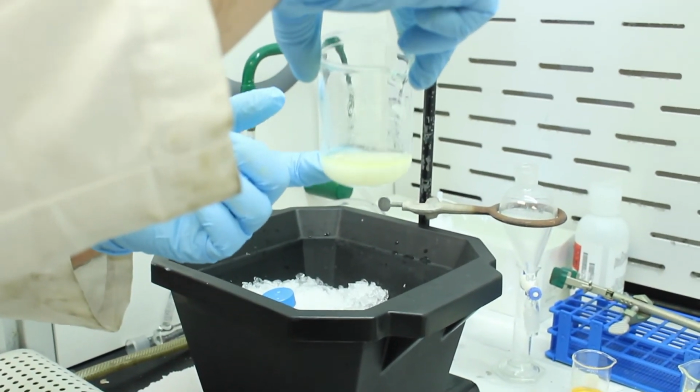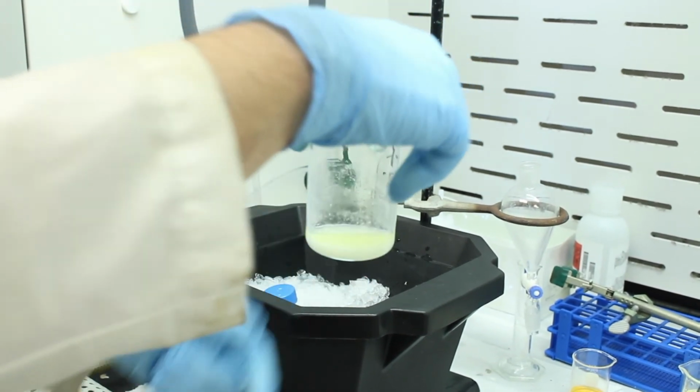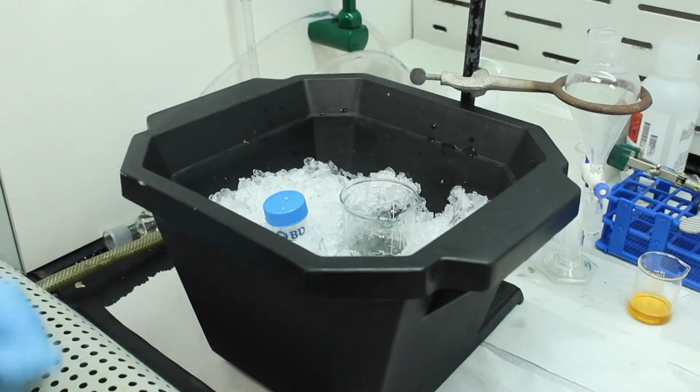So we're going to place this in an ice bath to make sure we get all the triphenylmethanol as possible, and then we'll filter away the hexane. So we have an ice bath in here. Keep it cool. Okay.